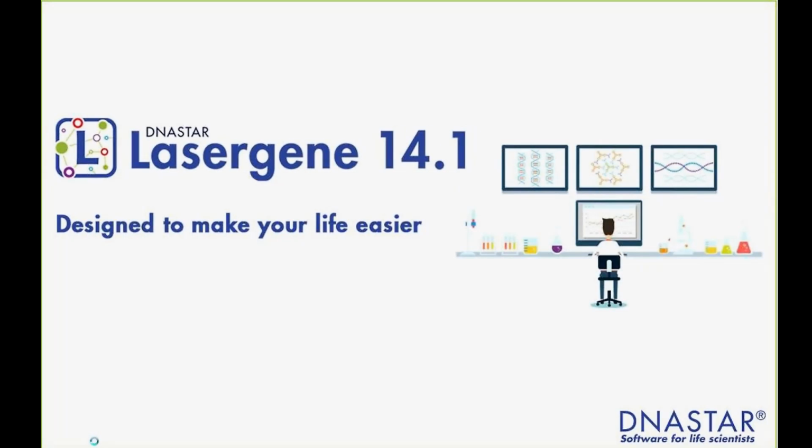I'd like to introduce, for those of you that are new to the company, we just have a few slides here where I can introduce you to DNASTAR. Our software is called Lasergene. The most recent version is 14.1. And we will have new software later this year. About twice a year we'll have different updates that bring new capability.